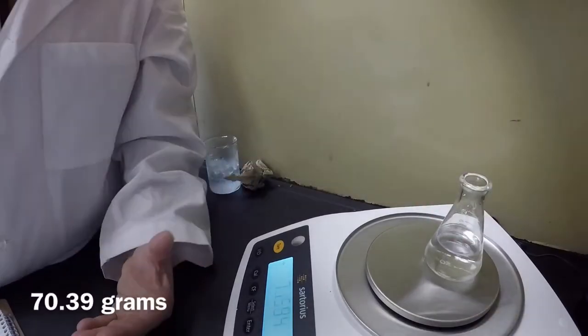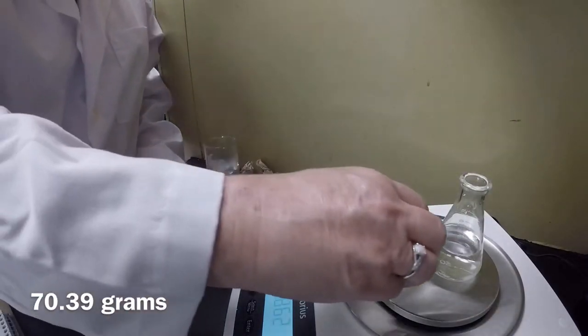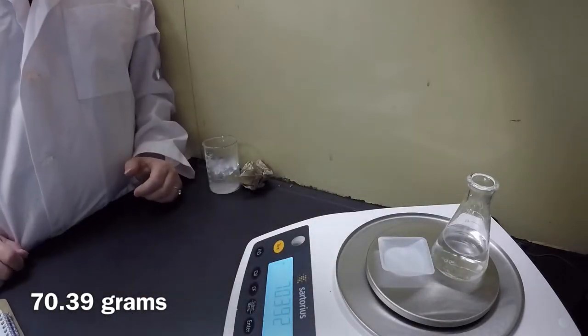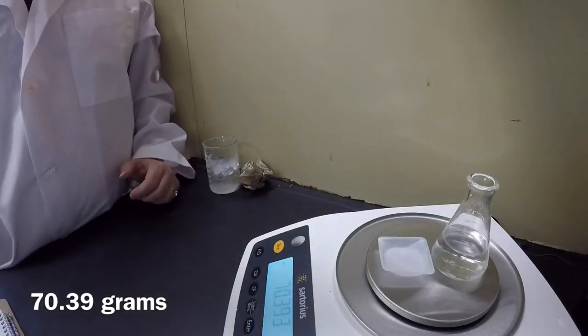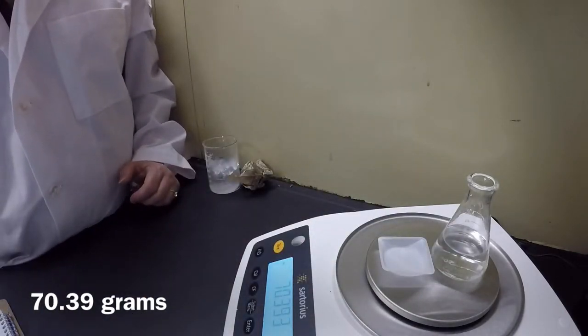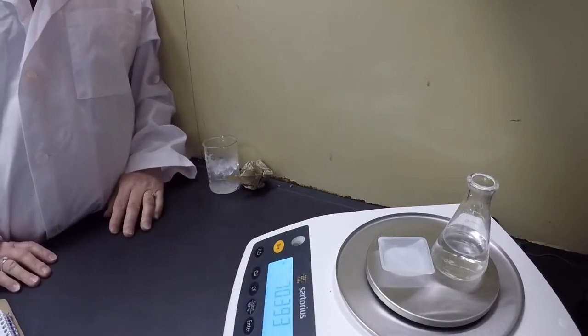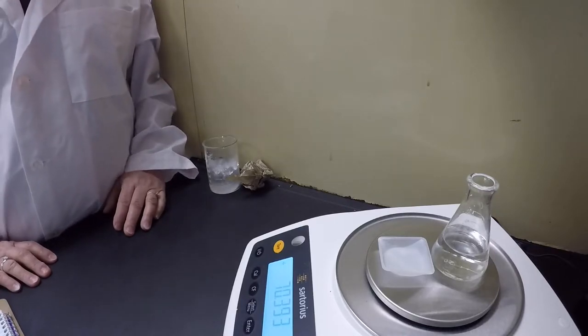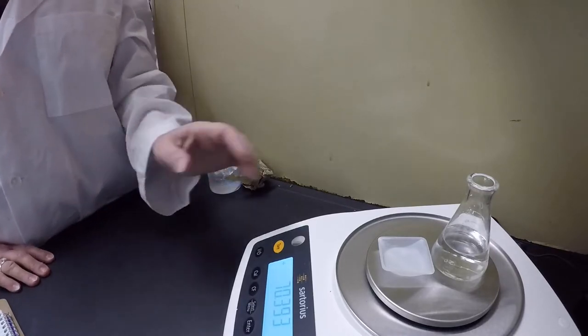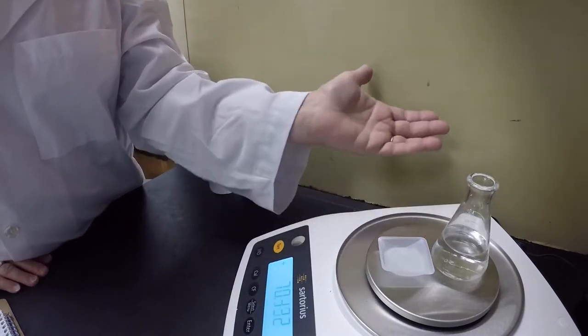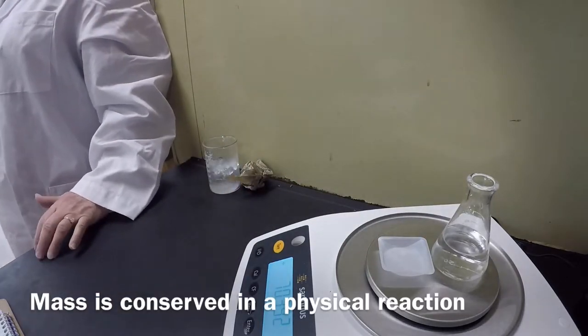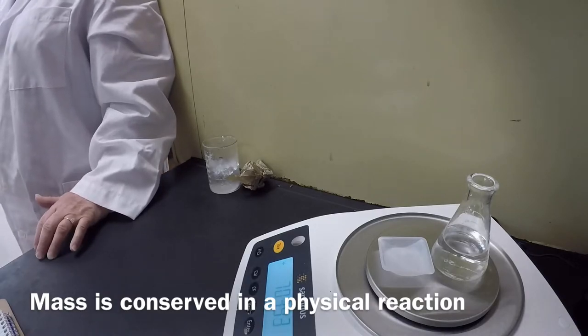So we're going to mass it again. And don't forget your weighing boat, because it did take up mass on our balance. And we have 70.39 grams of water and sugar, our sugar water solution. And we find that the mass has not changed. So even during dissolving matter, the mass does not change.